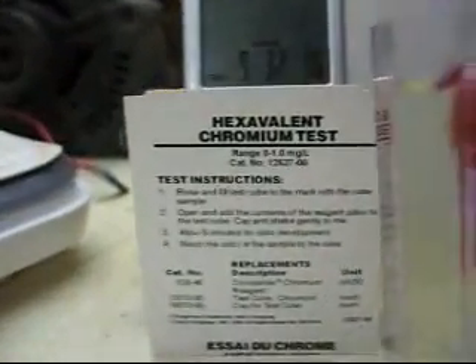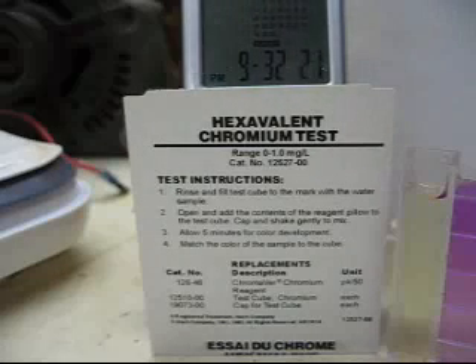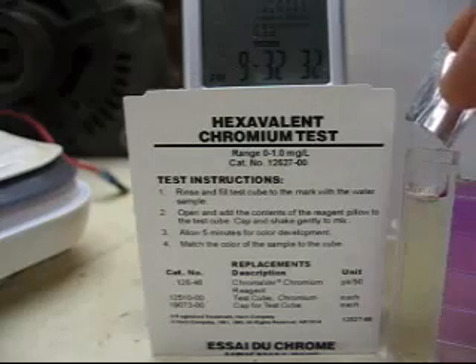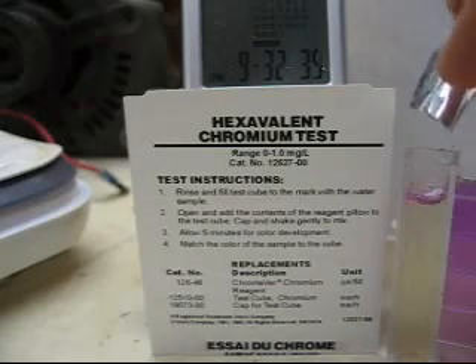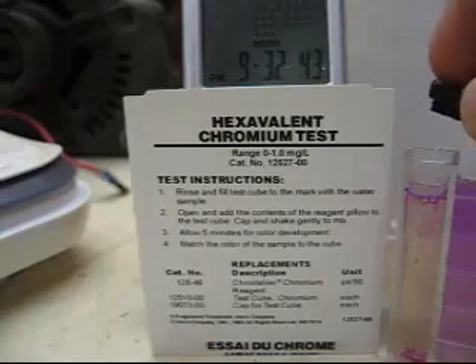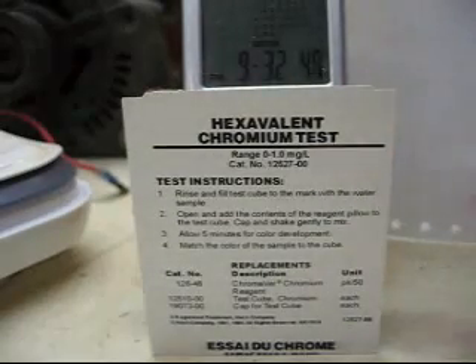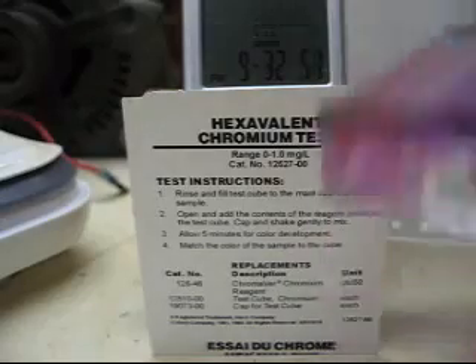Okay, I got my sample. It's a five minute test — five minute reaction period. So I'm going to put the powder pillow in it here. It says to shake it gently. And the contents right there — this isn't looking good. Look at the purple color already forming at the top. That's at about 45 seconds in. Look at that color turning already.